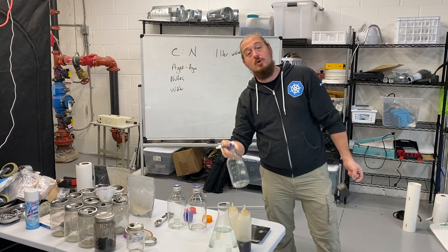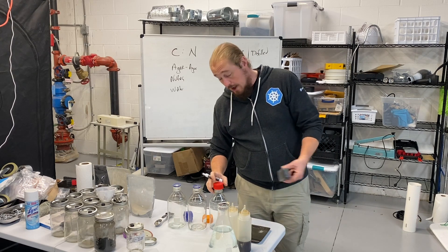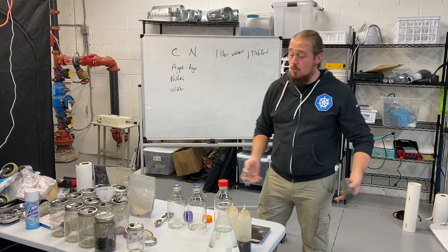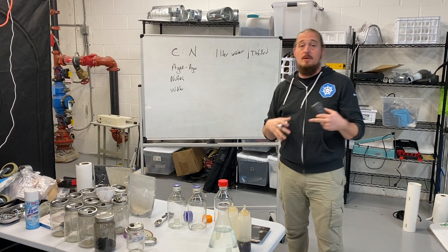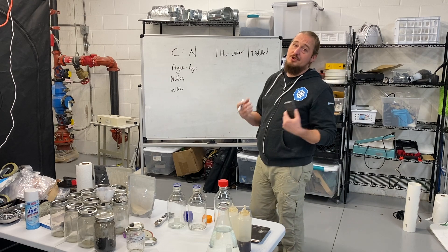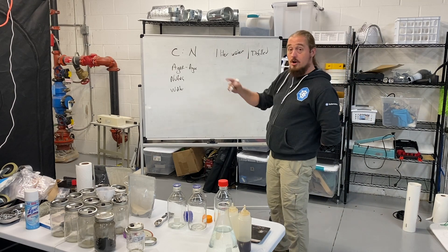This is a media bottle — a borosilicate glass bottle that is temperature safe. It comes with a cap. You don't have to use a media bottle; you could use a mason jar or any other glass vessel. You want to use glass because the agar powder and water mixture is going to be extremely hot — volcanic, essentially — as you're cooking it and sterilizing it, even as you're pulling it out of the pressure cooker. So stick with glass.